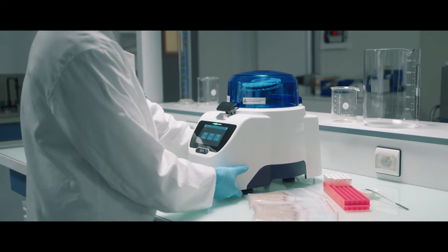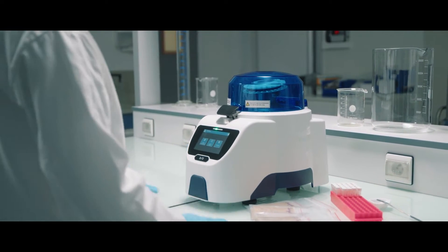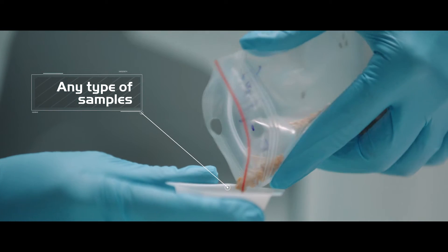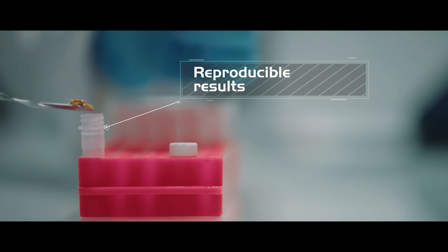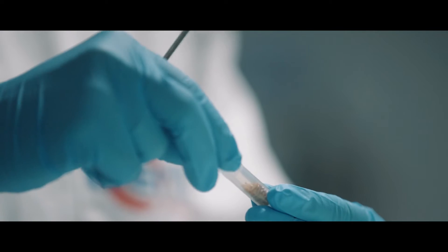Precelas 24 Touch grinds, homogenizes or lysis any type of soft or hard sample and has been validated on more than a thousand different samples.